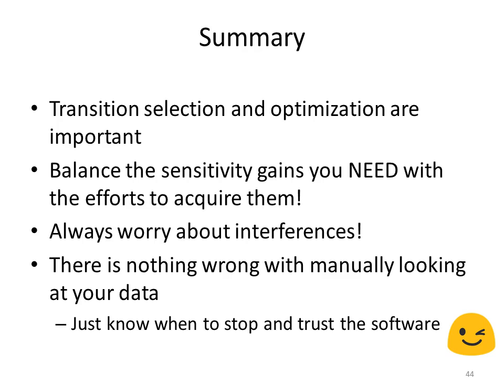And always worry about interferences. The people are different, their daily intake and diet are different, so plasma is different. You don't know what can be interfering with your sample or your peptides, so it's always important to keep an eye out. There's nothing wrong with manually looking at your data, but it's a balance. Just remember that there is software support most of the time, and if there isn't, you go and tell Brendan. The secret here, and I know he's going to hear this, is if he gets 3 requests for the same feature, it goes to the top of the list.